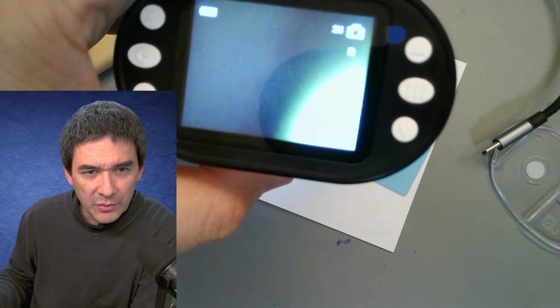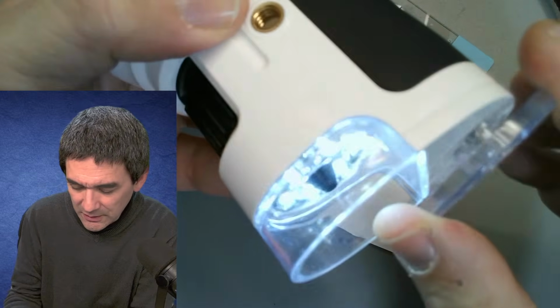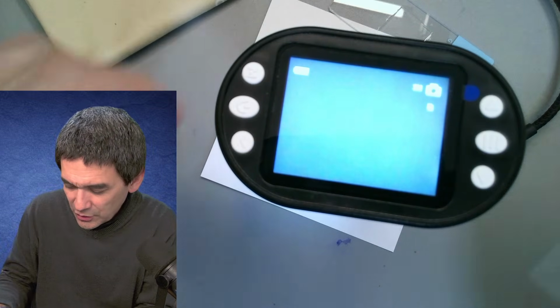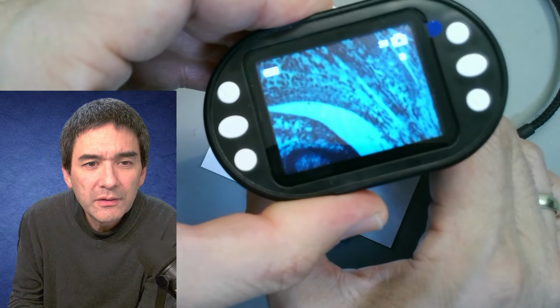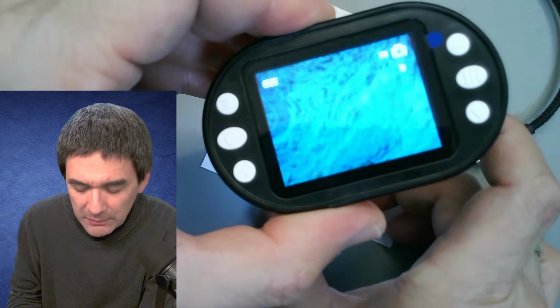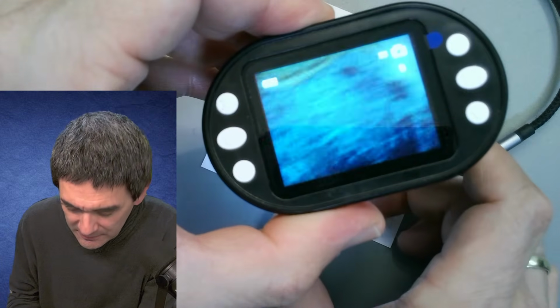And you know what I'm going to do? I'm going to use this opportunity now. It's disconnected, but now I have the display screen here. So we're just going to try it like this then. I'm going to use one of those permanent slides again to insert that. Now you're able to see it here on the screen a little bit. But something you're probably not able to notice quite well is that the image is actually cramped together a little bit.